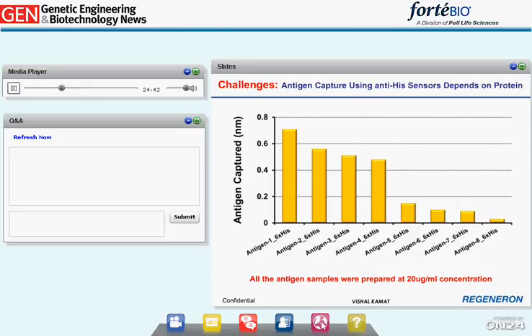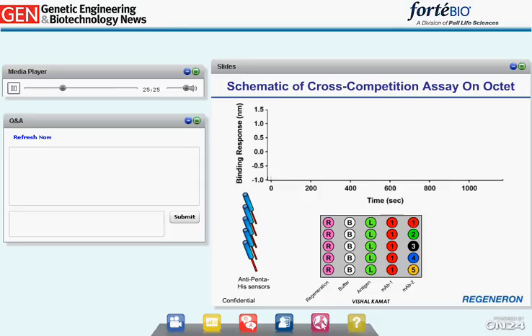During this screening and based on our experience, we found that the binding capacity of the anti-penta-HIS Octet sensors depends completely on the protein, and the capture level is different for different antigens. In this example, all eight antigens were prepared at 20 micrograms per milliliter with similar molecular weights, yet the antigen capture level was different. Around 0.7 nanometers of antigen 1 was captured, while very low capture levels were observed for antigen 8. We had to use a much higher concentration of antigen 8 for the assay — this is one of the caveats of using the anti-HIS Octet sensors.